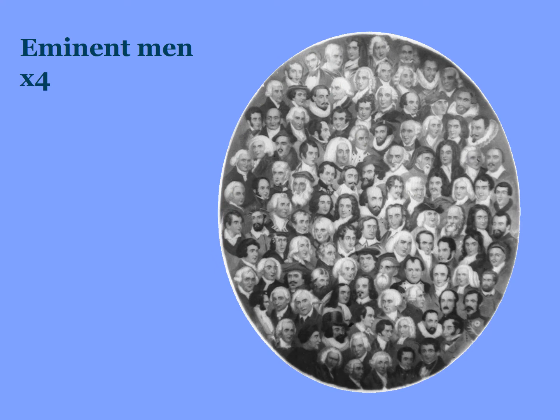If we scan that slide with a flatbed scanner on a computer, we can magnify it, but we're not resolving the detail in it. We have to use something that will resolve the detail, and that thing obviously is a microscope. And when we do that at ×4 magnification, you can see all these little heads pop out at you.